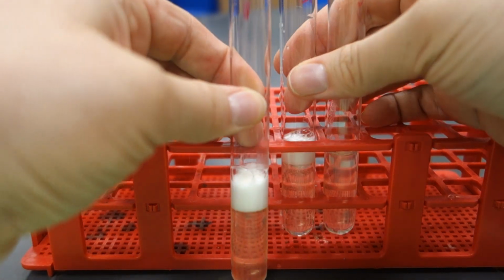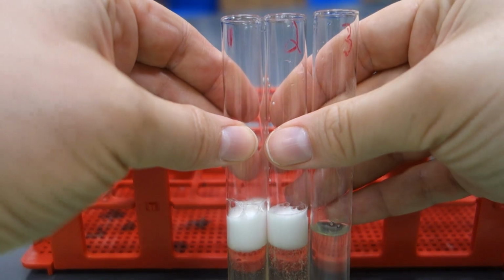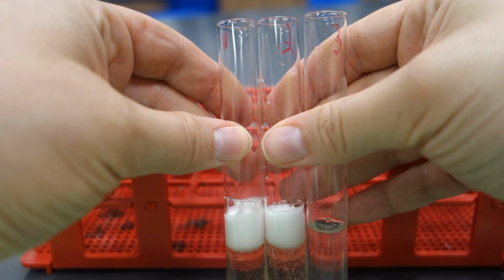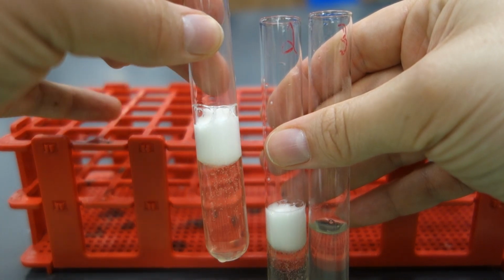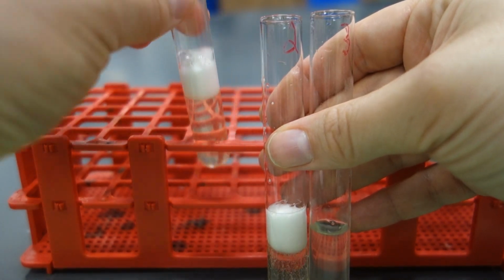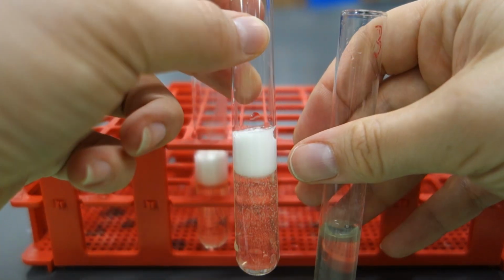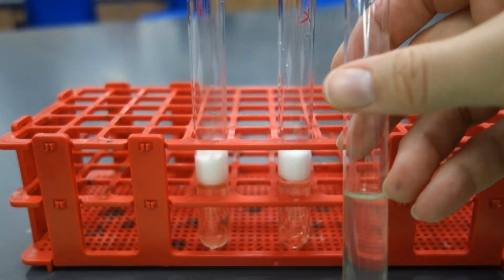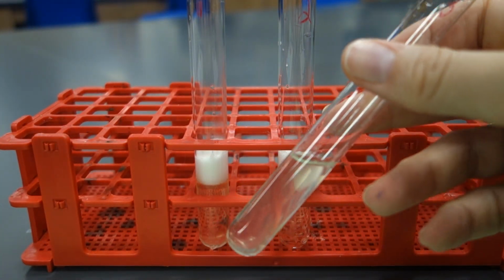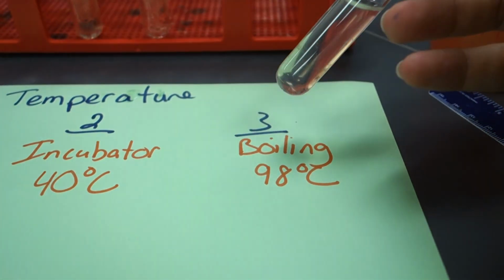So what you can see just by comparing them is that with the potato, the enzyme is working very, very, very well with ice water, right? Potatoes often live under the ground. So that does make sense. Then test tube 2, which is that kind of warmish temperature, is working pretty well, right? It's doing all right. But 3, nothing. Why? It was in boiling water, right? Test tube 3 was the one that's in boiling water.